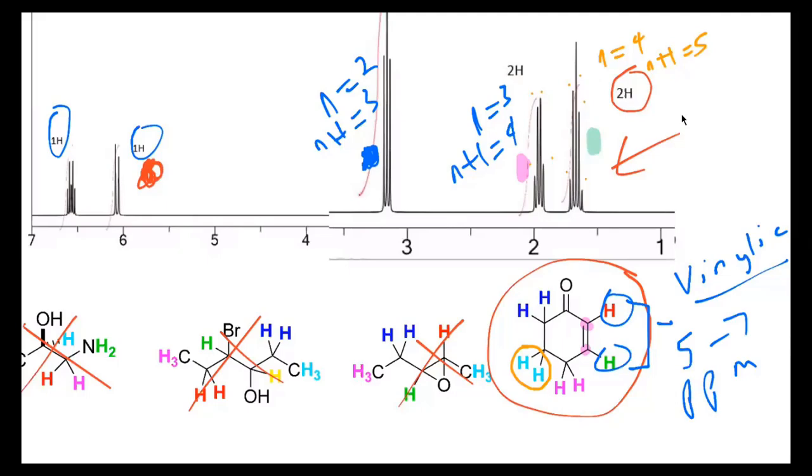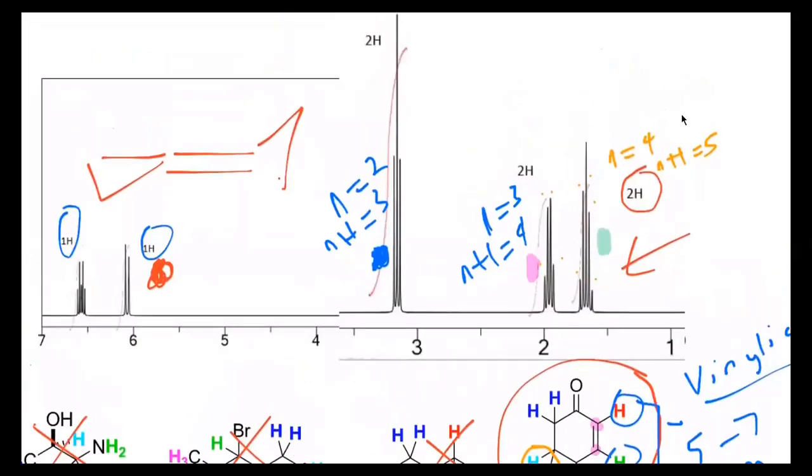The double bond itself is flat, right? So the ring kind of looks like this. So that carbonyl doesn't have as much influence as you think. It's kind of pointed up this way, so your protons will be here. So it's possible that the carbonyl is more attracted to this proton with that lone pair than the other one. So that may be why it's further downfield.